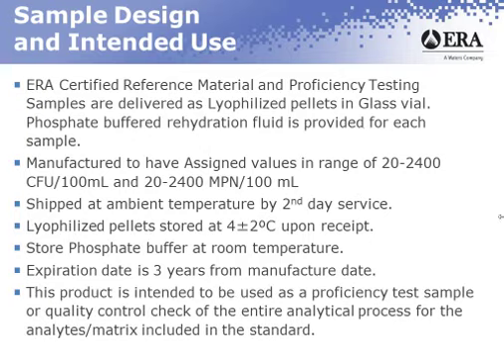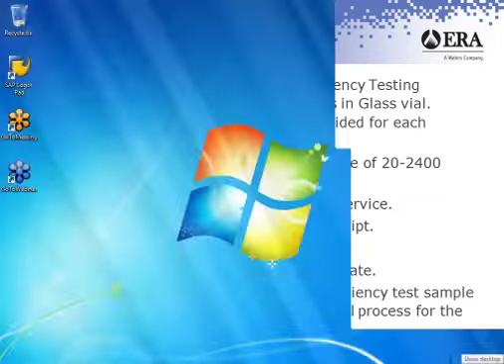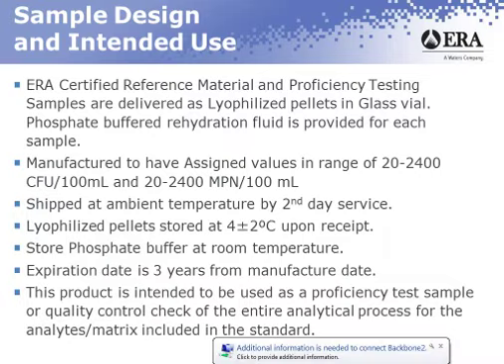Doing it in any kind of modified process, whether that's a controlled dried process like a Vitroid or a lenticule, or it's a whole volume, all of those do involve some preservation, but they're less recognized as really ensuring the long-term integrity of not just the viability of the organism, but the integrity.